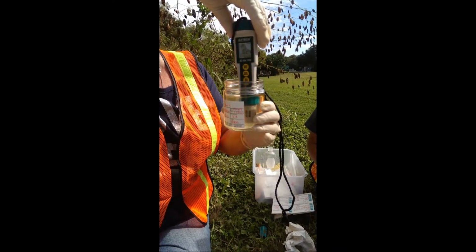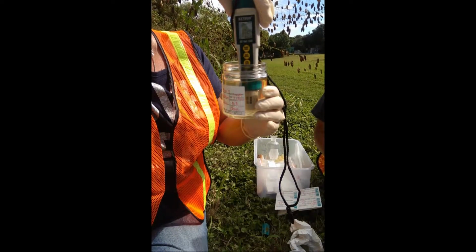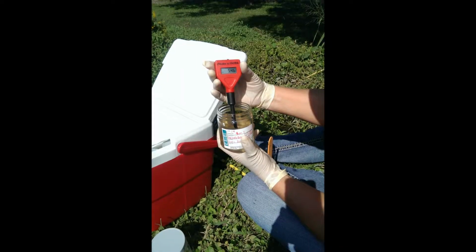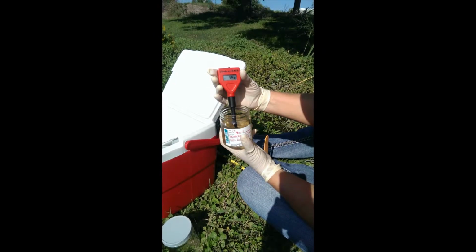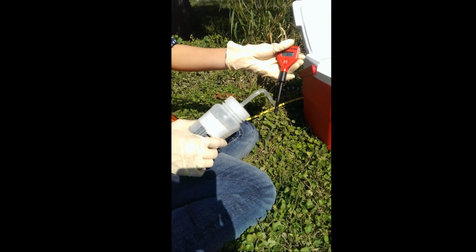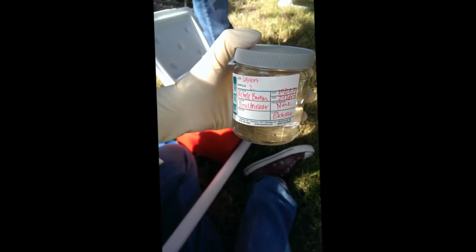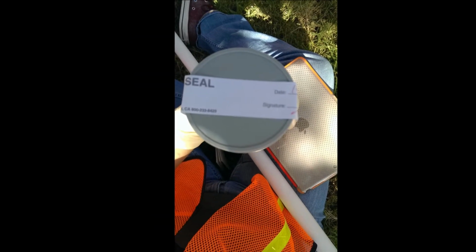Using the conductivity meter and pH probe, measure the temperature, pH, conductivity, and total dissolved solids of the sample and document them in the field logbook. Be sure to calibrate and sterilize the machines between each sample. Next, seal the samples with an airtight lid and place a chain of custody seal across the top. Finally, place all samples in a chilled cooler for sample preservation.